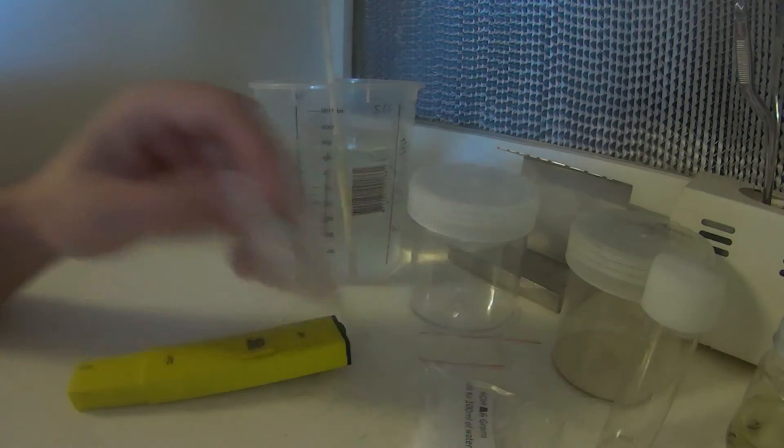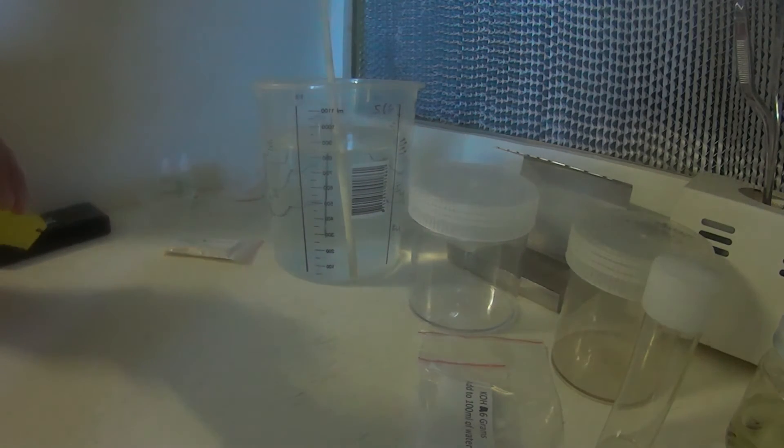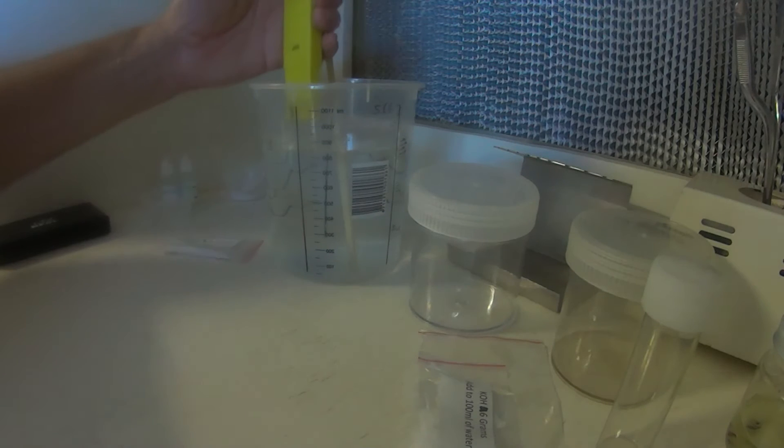Now before we add the Gelrite, I'm just going to test the pH, just to get it up to around five and a half. I don't necessarily have to, but I like to get it around there before I add the Gelrite to the media, just seems to mix in a little bit better if the pH is a little bit closer to the mark.